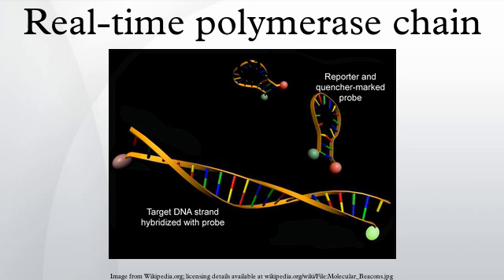Two common methods for the detection of products in quantitative PCR are non-specific fluorescent dyes that intercalate with any double-stranded DNA, and sequence-specific DNA probes consisting of oligonucleotides that are labeled with a fluorescent reporter, which permits detection only after hybridization of the probe with its complementary sequence to quantify messenger RNA and non-coding RNA in cells or tissues.